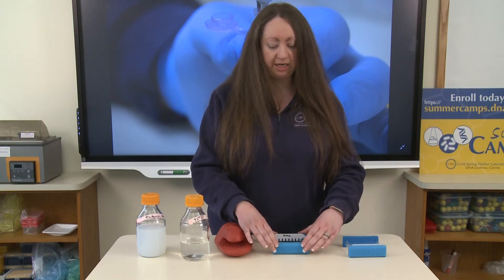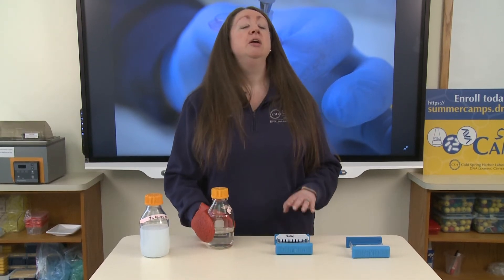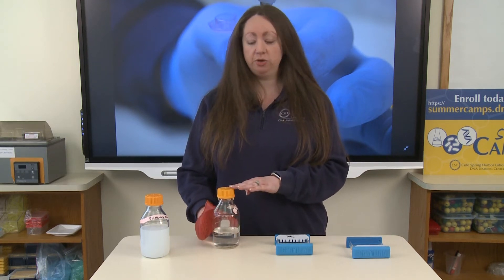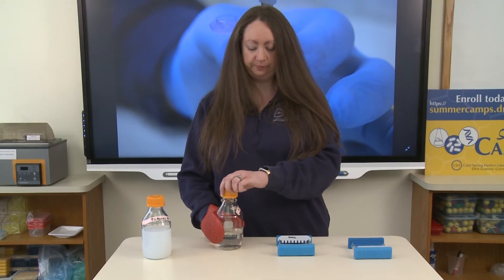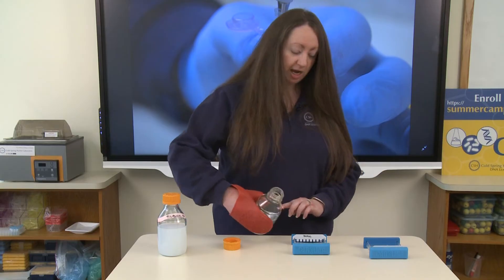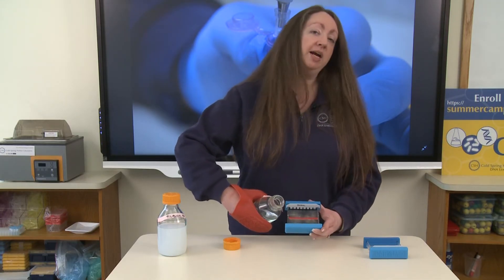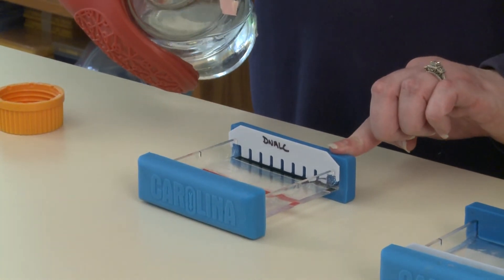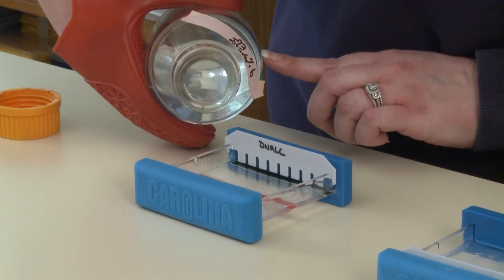Once our casting tray is set up we can now pour our hot agarose into our casting tray. Be very careful when you're pouring because the solution is very hot, so make sure that you are handling this with something that is heat resistant. Pour the agarose solution into the casting tray until it's about halfway up the teeth of the comb. We have a line drawn here so that we know approximately how far to pour it, but if you don't have a line you can just pour halfway up the teeth.